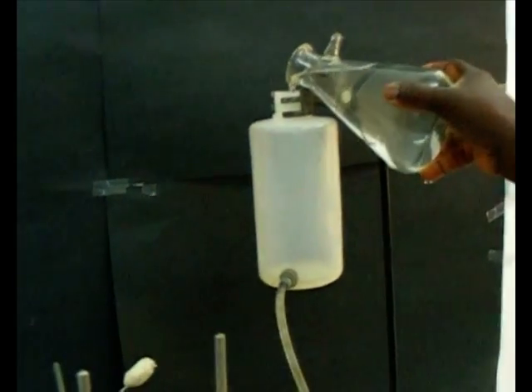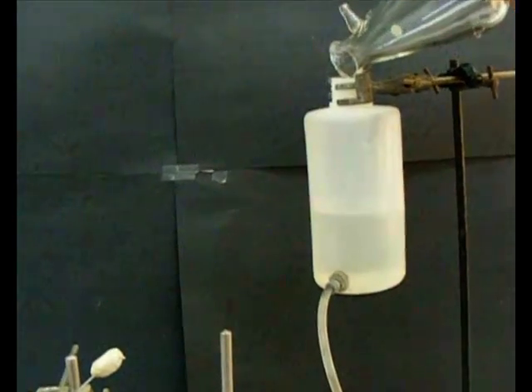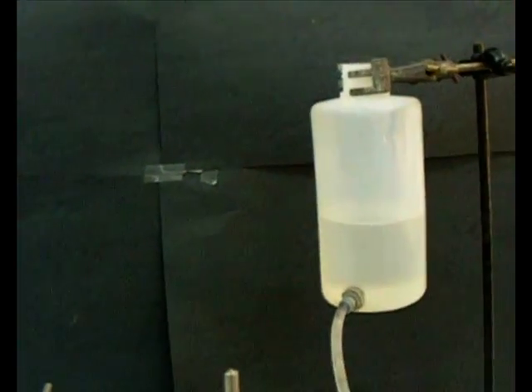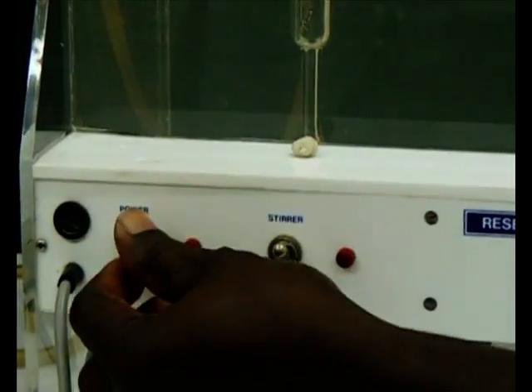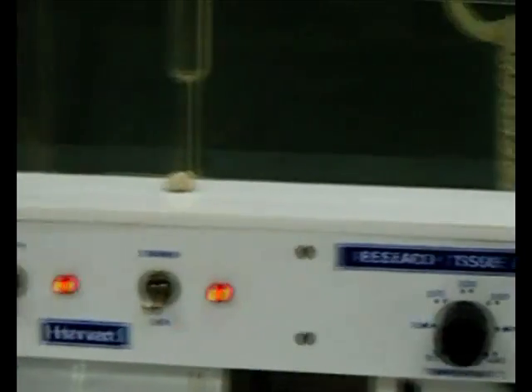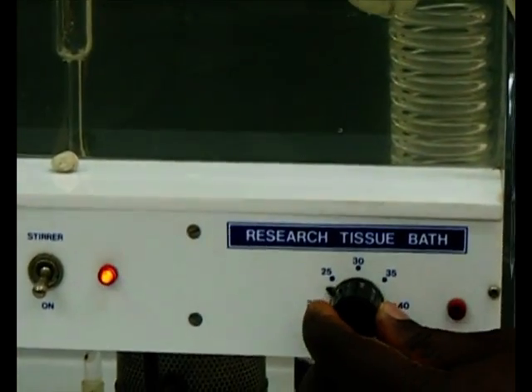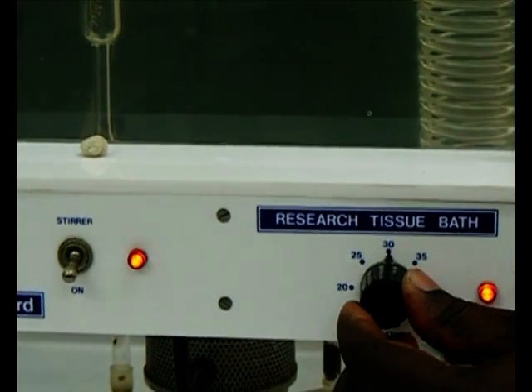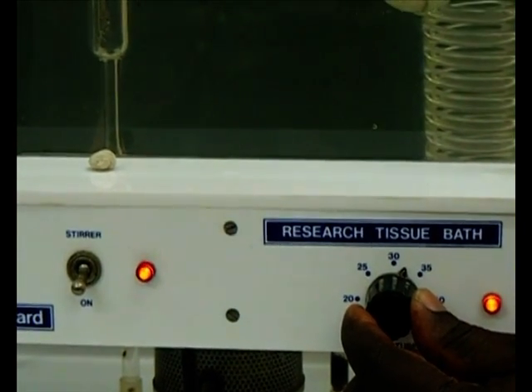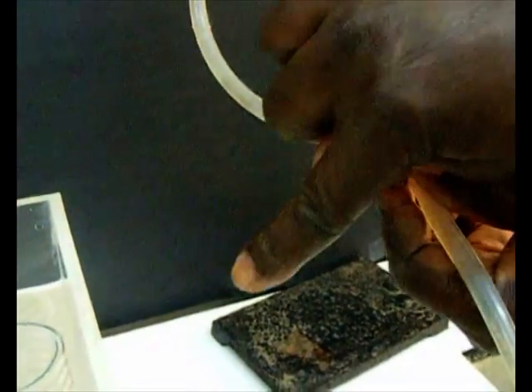The physiological solution is poured into the reservoir. The power button and stirrer buttons are turned on. The temperature knob is set to the required temperature. The inner bath is then filled with physiological solution.